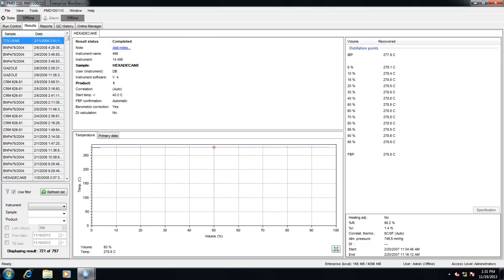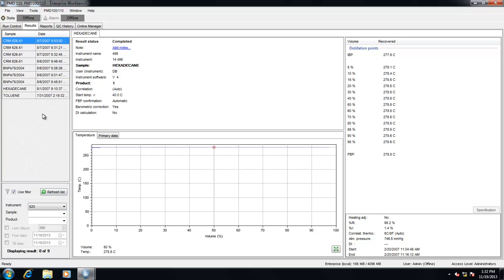IRIS has an intuitive and easy-to-use filtering system. If the user wishes to filter a result, simply check the box or use filter at the bottom of the results window. The options provided are for instrument, sample type, product, or date and time range. As you can see, we're displaying 797 results — all results for all instruments on our network for the instrument type PMD110. If the user wishes to select a specific instrument, simply select the instrument field, select the desired instrument, and click Refresh List. Now you'll notice we're displaying 9 results for this particular instrument of type PMD110.